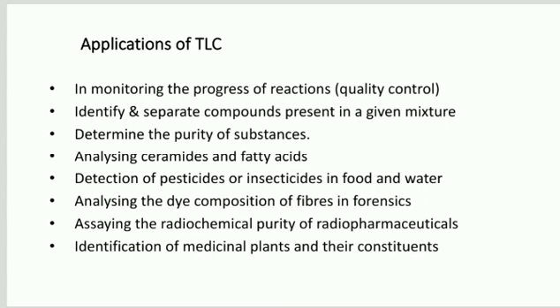Applications of TLC: monitoring the progress of a reaction. Identify and separate the compounds present in a given mixture. Determine the purity of a substance. Analyzing ceramides and fatty acids.